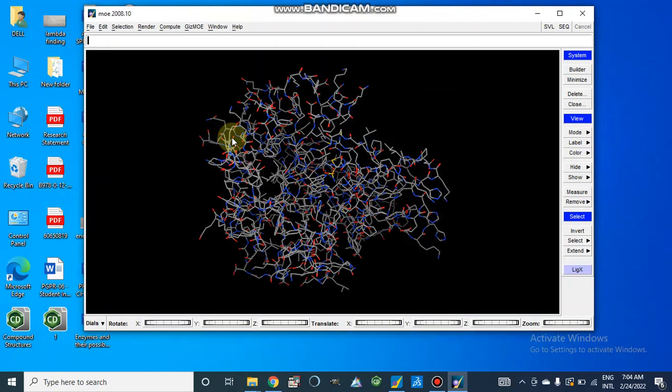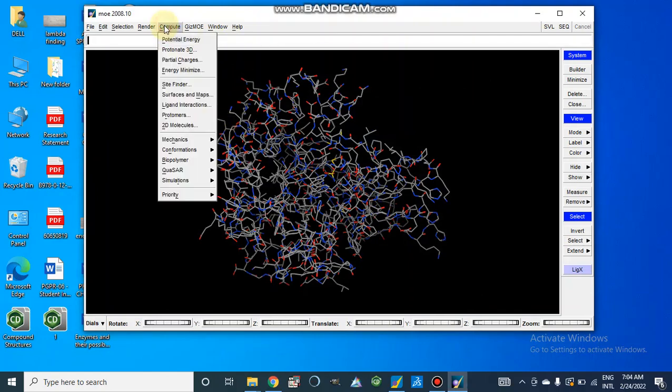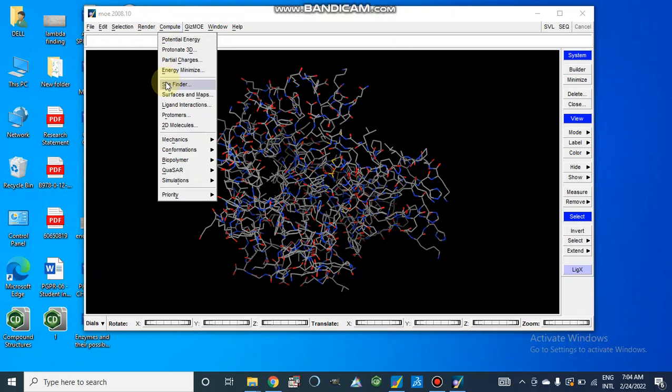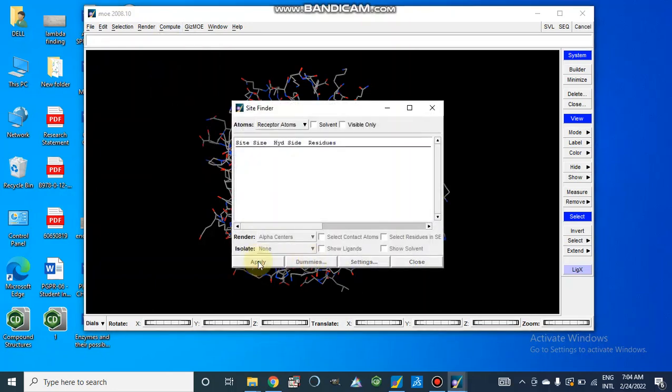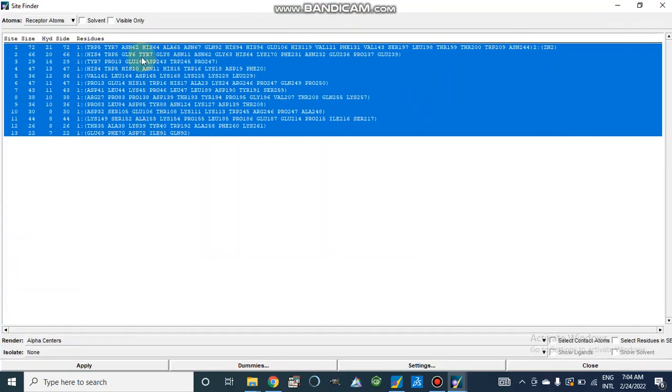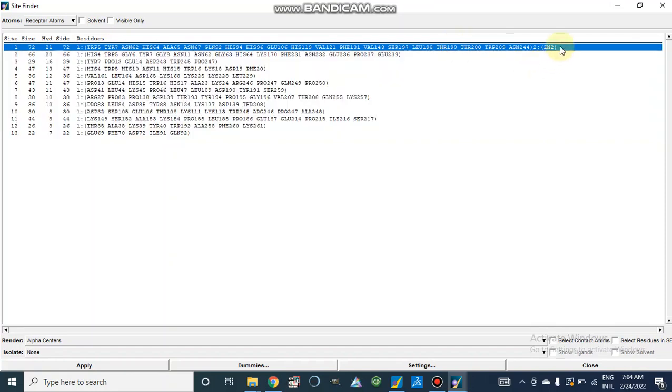After this, we will go to compute and we will click on site finder. When we apply, it will give several different sites and residues, but the first one contains zinc which is present inside the active site of this carbonic anhydrase. So we should know what will be the active site for our target protein.